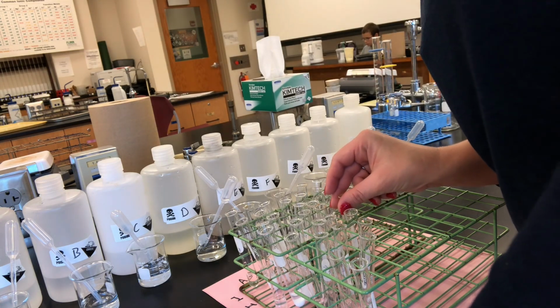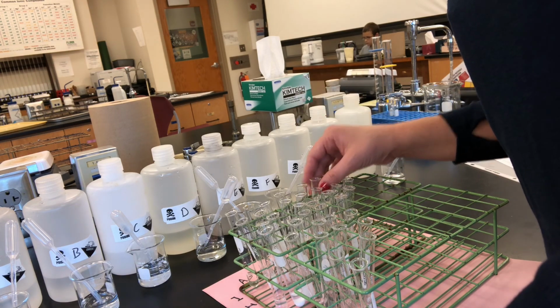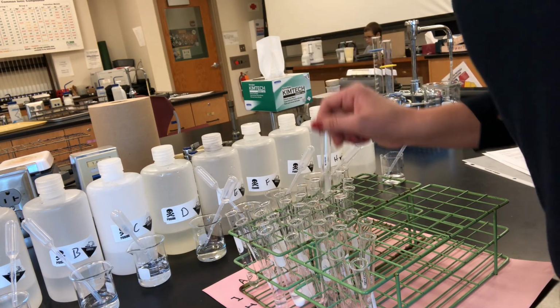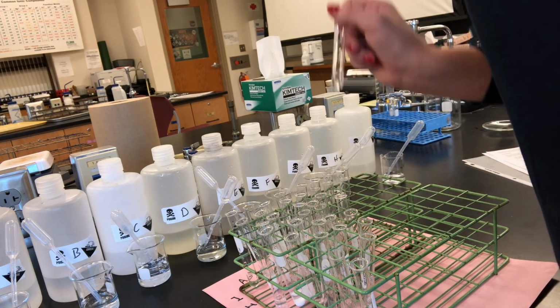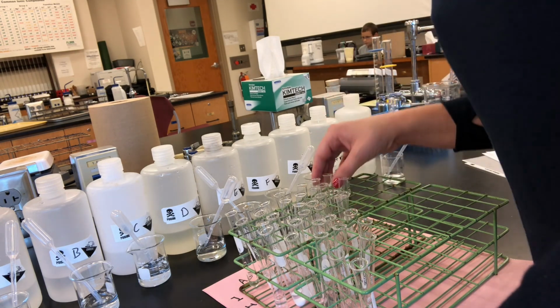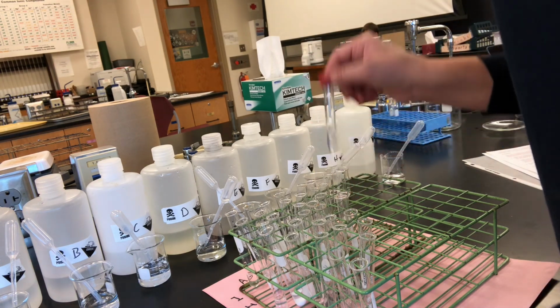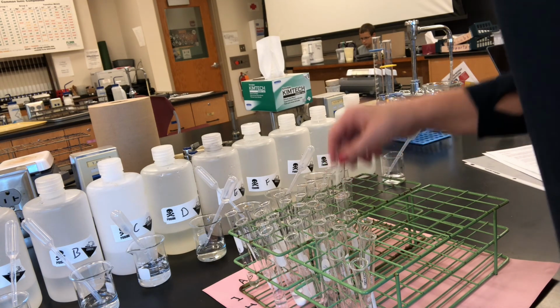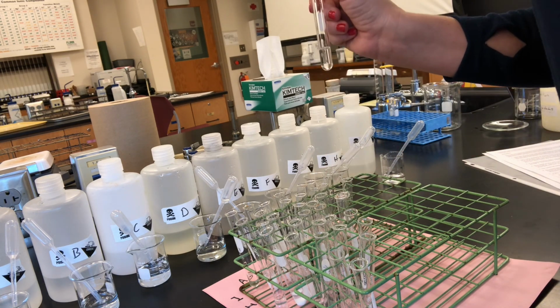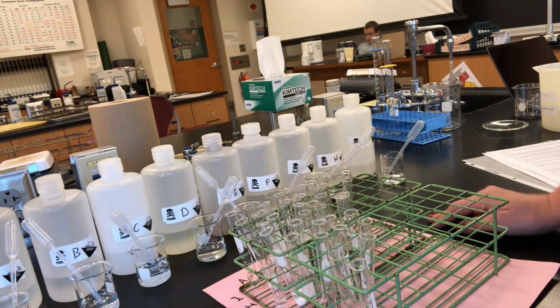F and I was no change. F and H was no change. F and G was no change. G and I was no change. G and H, no change. And H and I, no change. All right, guys, that is the end of the experiment.